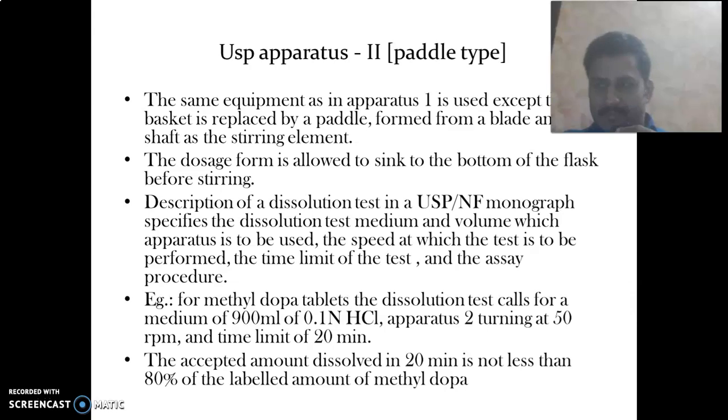Usually for basic drugs, you will be using acidic media; usually 0.1 molar hydrochloric acid can be used. Or we can use alkaline media for the acidic drugs, like some alkaline buffers. And for alkaline drugs you can go for acidic media like 0.1 molar hydrochloric acid. That is usually recommended. But when it is specifically given in the monograph, that medium you have to use, specifically some pH 7.2 buffer, phosphate buffer or pH 7. It will be mentioned in the monograph, and based on that you have to select the dissolution medium.